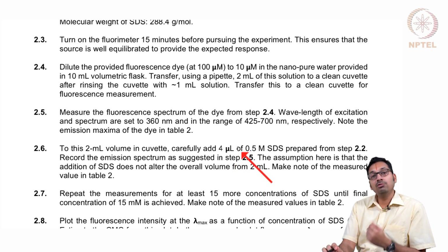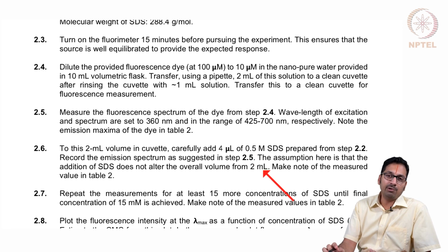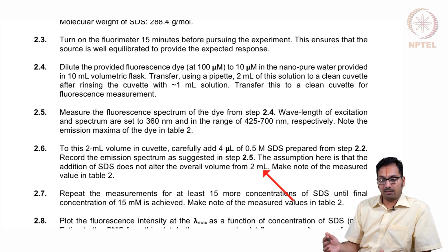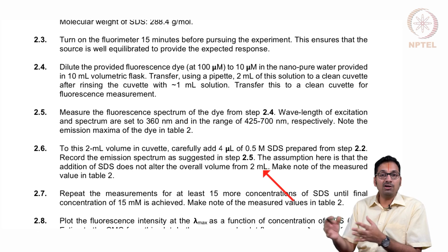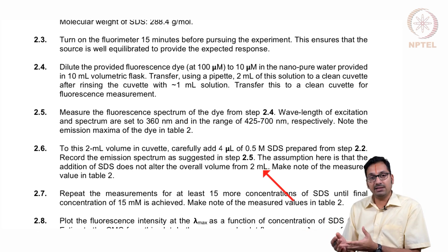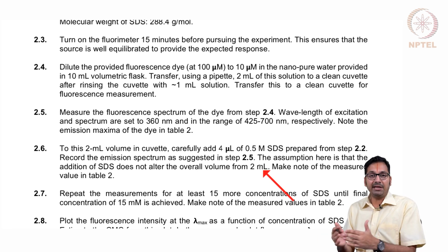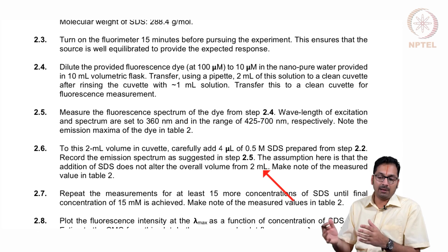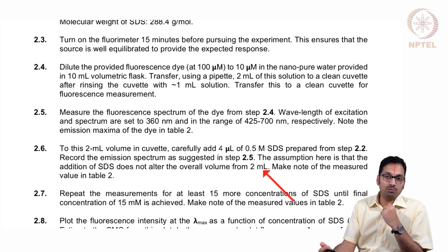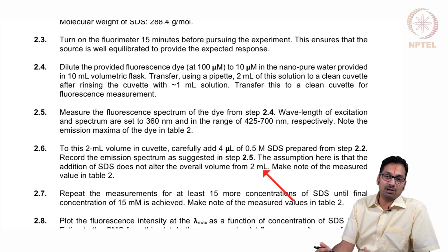Once that is done, you in theory should let the solution equilibrate for a few minutes before you do your measurements. As you are able to realize, although we are doing a thermodynamic experiment, the kinetics of formation of the micelles need not be always fast. In this case it is indeed fast, but if in case it is slow, you have to let it equilibrate for a finite amount of time. Generally something between 10 to 15 minutes for a fast aggregating system is good enough such that when we make a measurement, it's indeed in its equilibrium state.